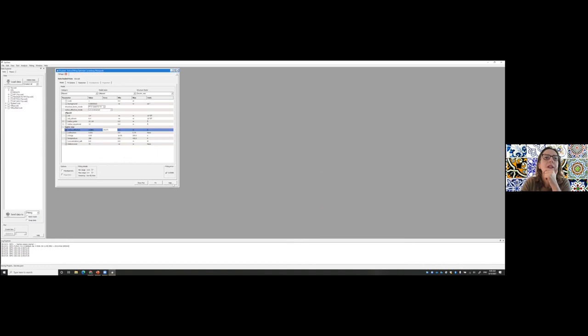But also, again, I recommend you click on the help, go to the documentation and look up the reference for the models that you're using, because they will give you a lot of comments and recommendations. They will tell you this model will not produce a stable fit. For example, it'll tell you it's not designed for very dilute solutions, or for particles that are not charged. So if I had put a zero here, we would not get a decent fit at all. The reference and documentation help you know what you can and cannot do.